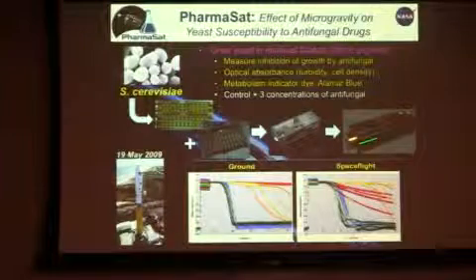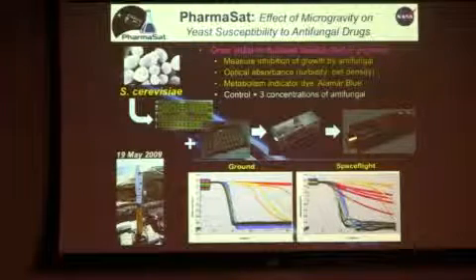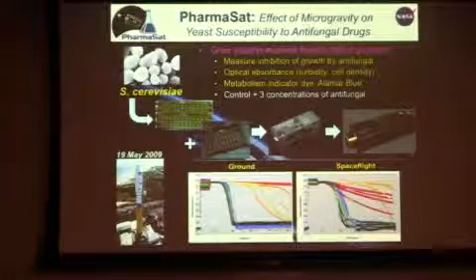the Cerevisiae are, the temperature would go up by about 5 degrees Celsius by the end of that second stage burn, and that was perfectly okay. So it starts out cold. So apparently that was true because, look, we got data back from outer space.